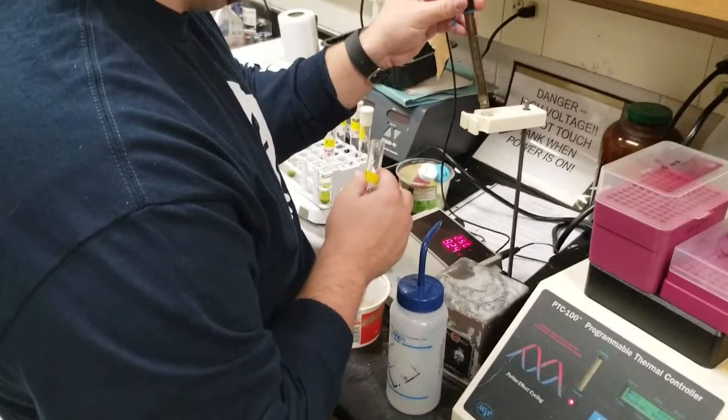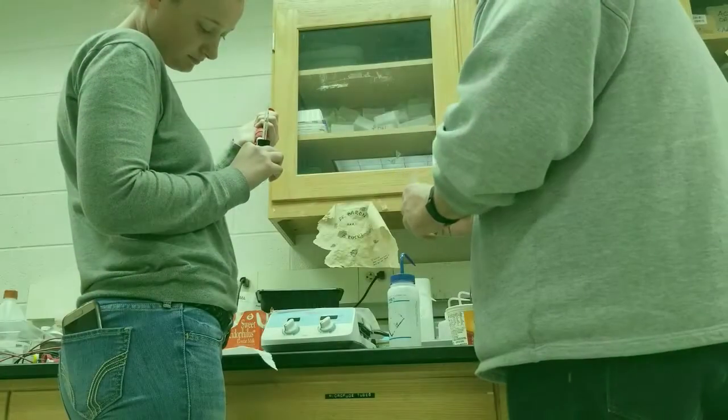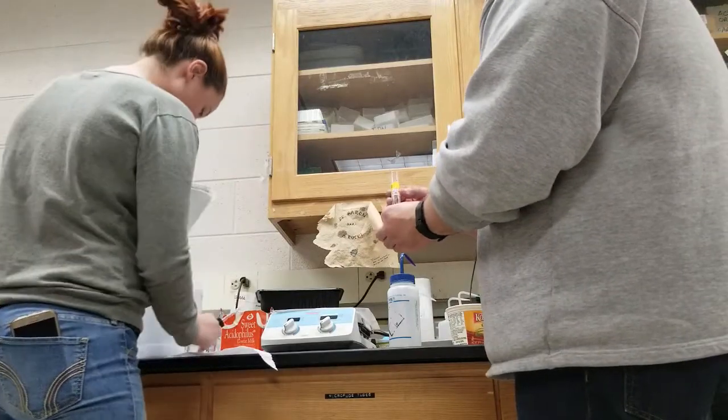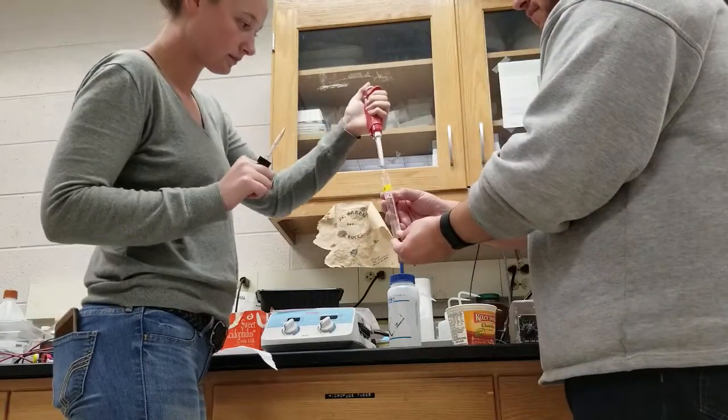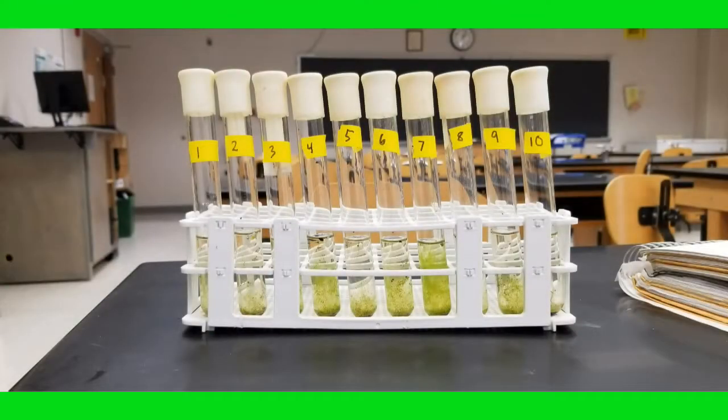Using the pH meter, we recorded the pH of all algae samples. Using a micropipette, Katie added 0.5 microliters of 6 molar hydrochloric acid to lower the pH and 6 molar sodium hydroxide to raise the pH. On Tuesdays and Thursdays, except November the 23rd, we checked the pH of algae to measure the changes over time.